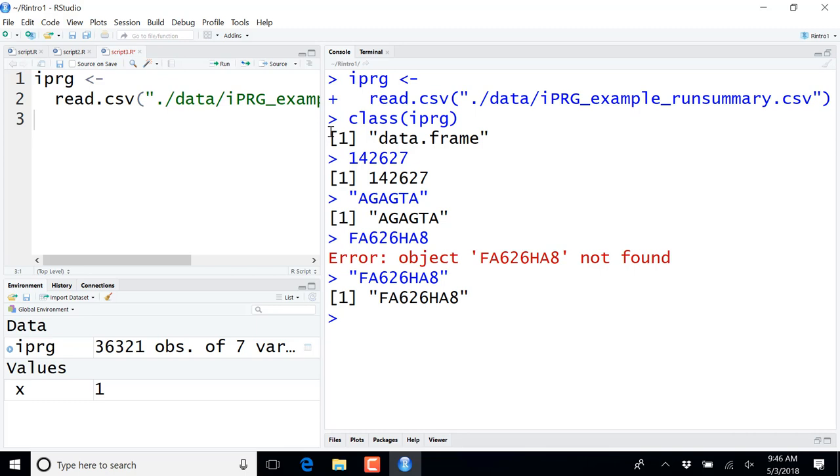And along the columns, I have variables. So my first variable was protein, I had variable intensity, a variable run, variable biology replicate, technical component, and so on. So that means that any row that I take, or any two rows, are equivalent observations. For any row, the first element corresponds to the protein identifier. The second element corresponds to the intensity for that protein. The last element corresponds to the technical replicate. So I can reason on my rows.